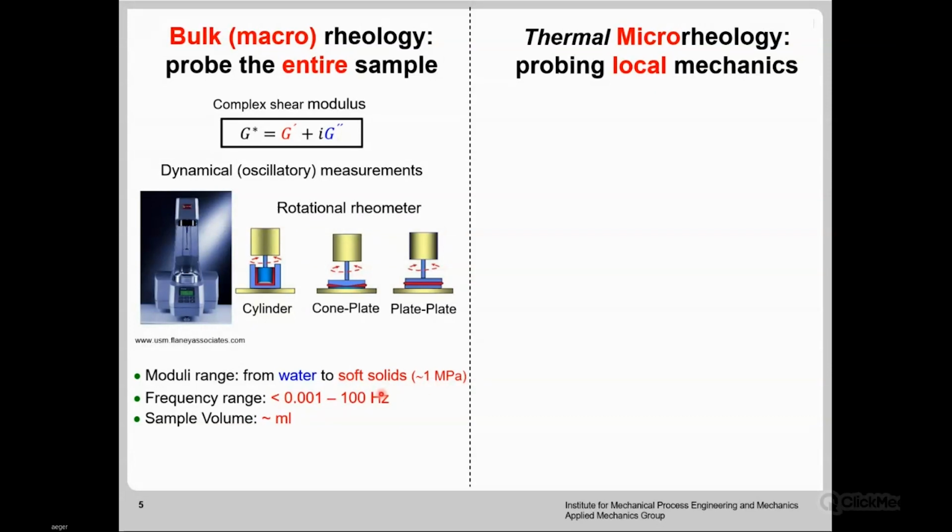So with this rheometer, you can measure low frequencies, but you can reach only around a maximum of 100 hertz. This is the maximum frequency you can measure. Concerning the sample volume, you need milliliters of sample.